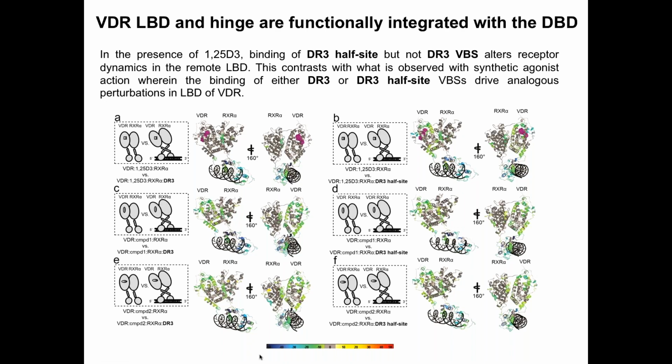So this can be specifically studied by deuterium exchange. And I don't think cryo-EM or crystal structures can reveal such dynamics in solution, or in terms of paper writing or story presentation.